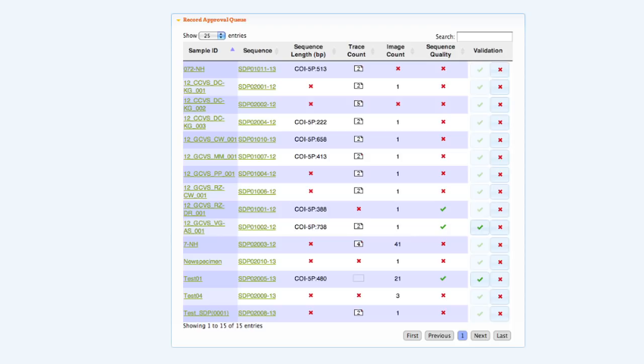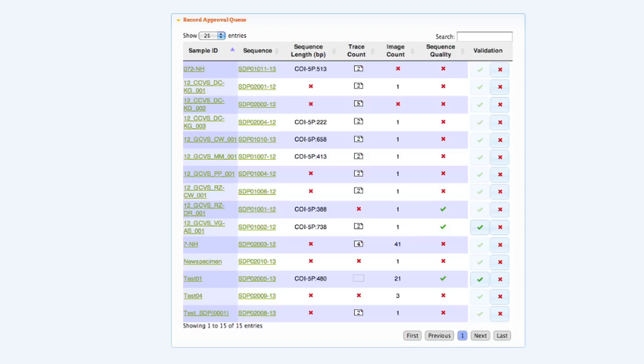Following these steps will allow students to create a complete DNA barcode record on BoldSDP. Check out video 3 for information on how to oversee a course and manage student data.